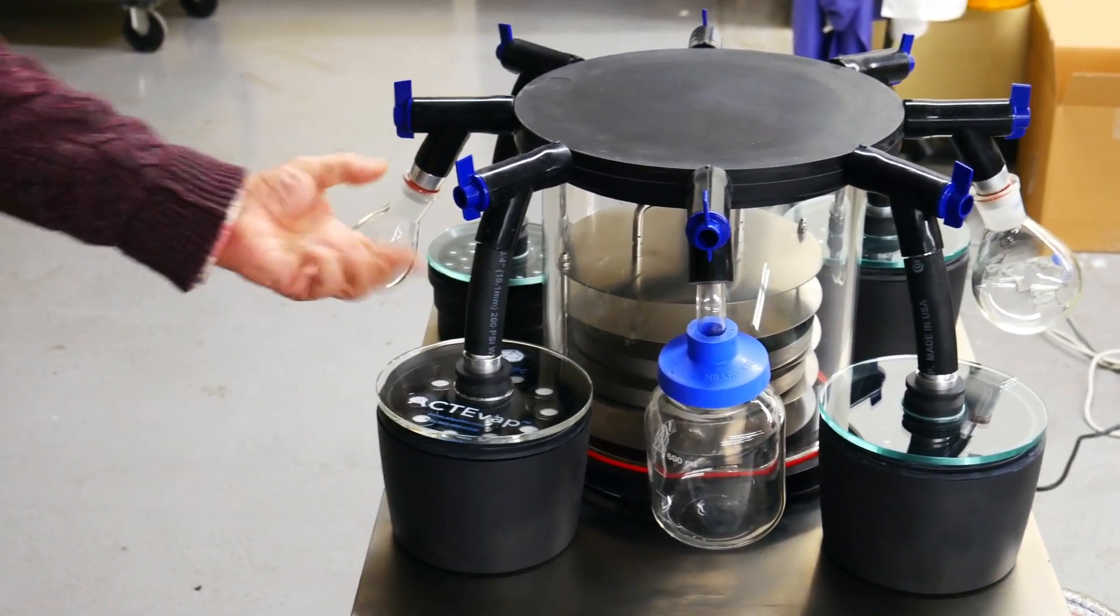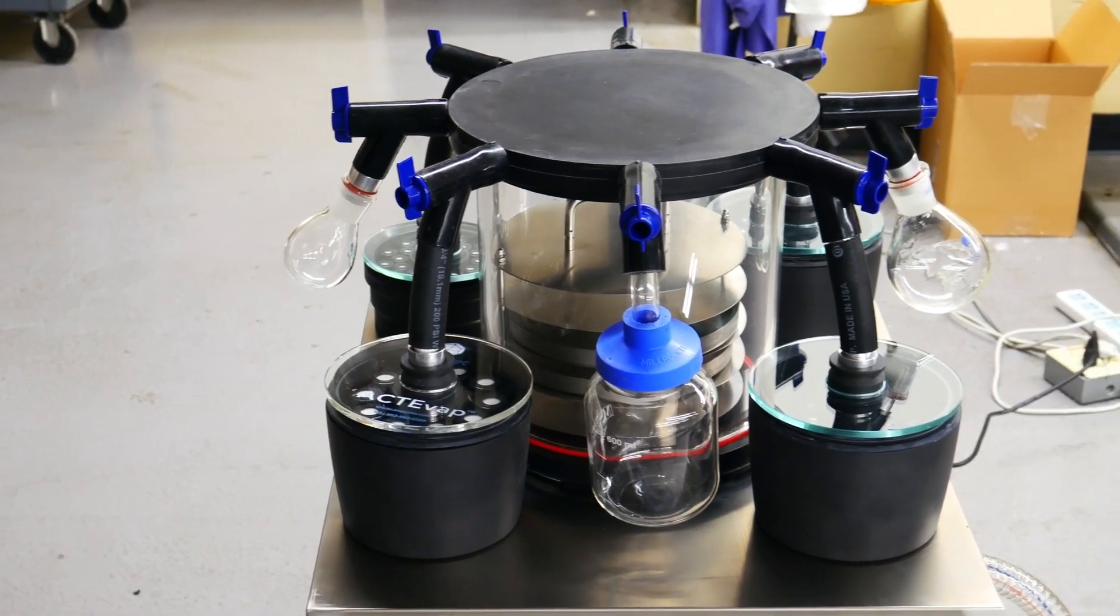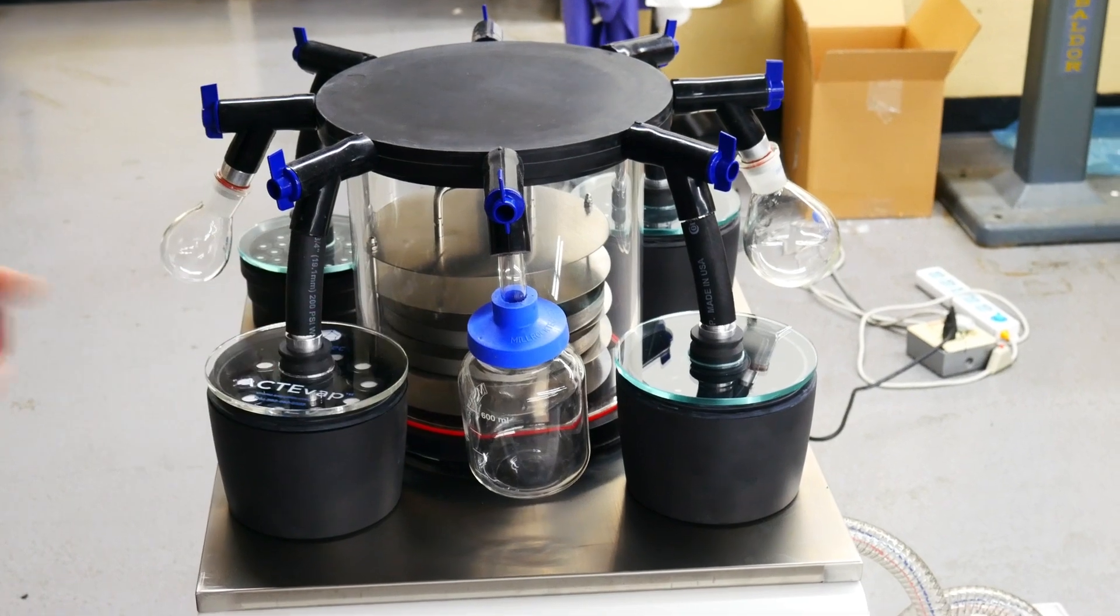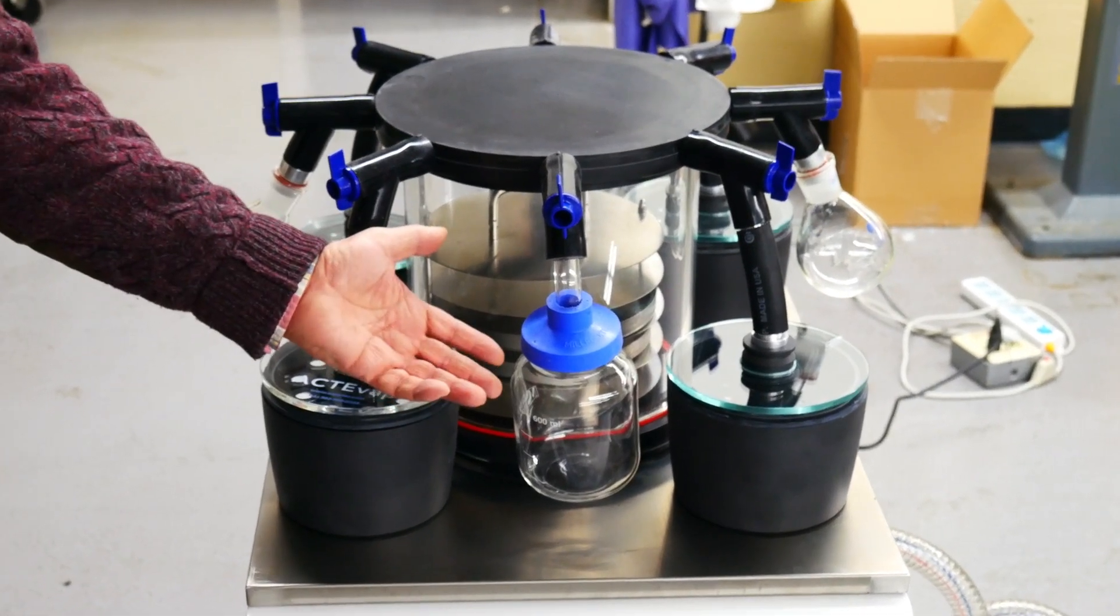You can use a regular flask for the freeze drying. It can be in the size of 1 liter, 2 liters, 1.5 liter, or in smaller flask sizes.